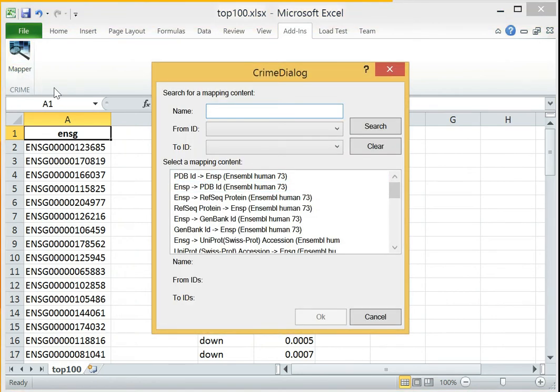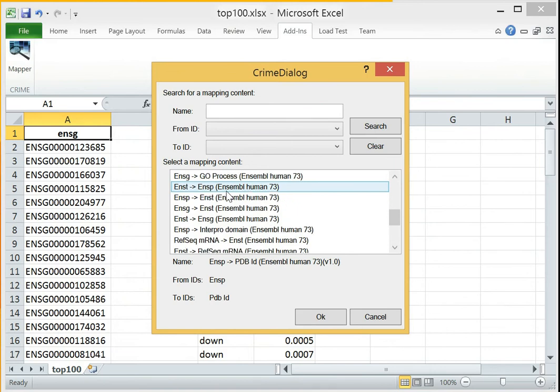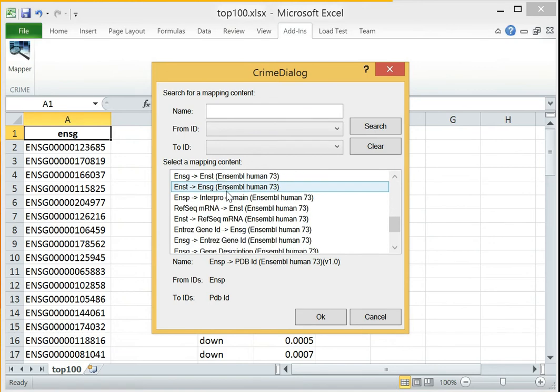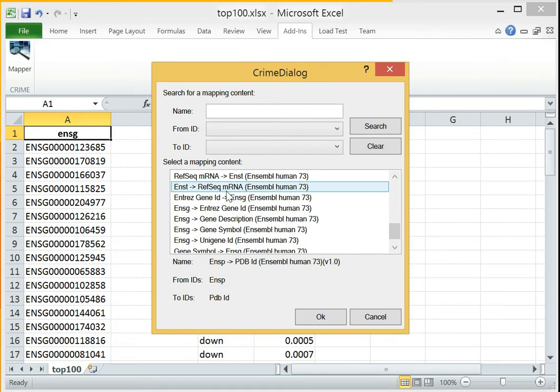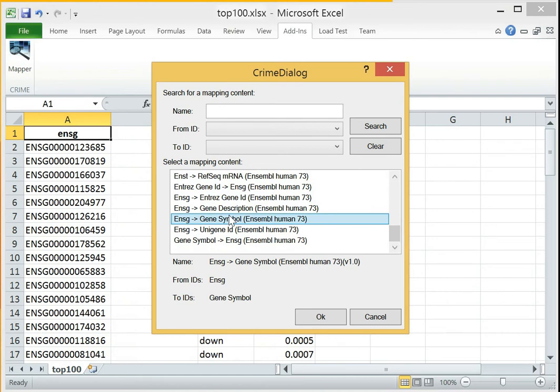In the first step, we have to select the mapping we want to perform. Our file already contains Ensembl gene IDs. Therefore, we select Ensembl gene to gene symbol from the list of available mappings.